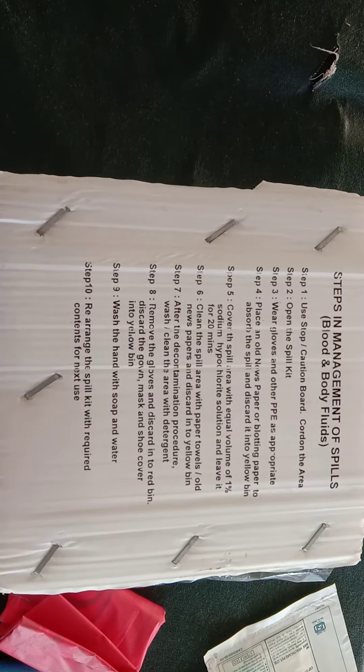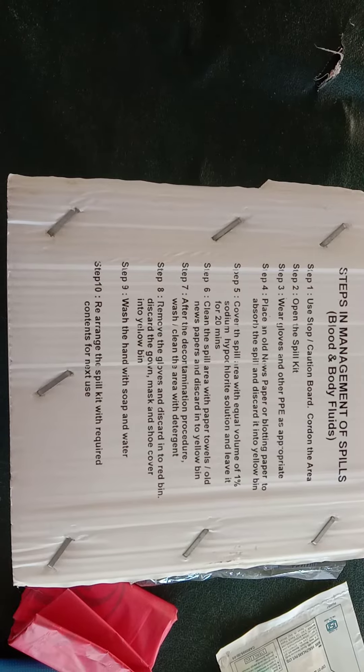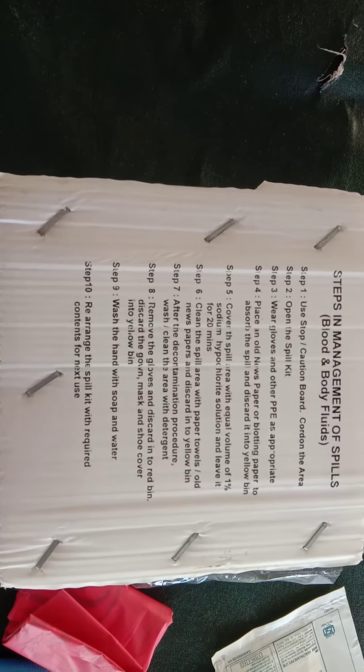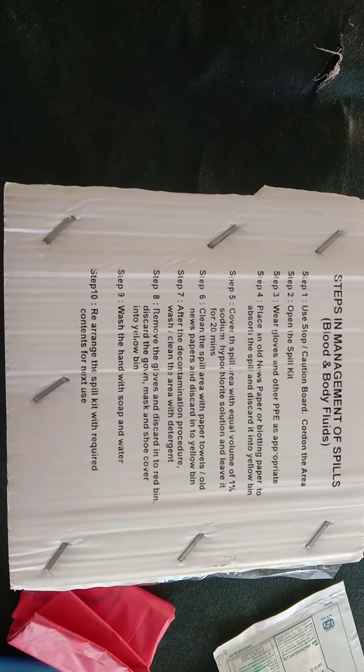Cover the spill area with an equal volume of 1% hypochlorite solution and leave it for 20 minutes. Then clean the spill area with paper towel or old newspaper and discard it in the yellow bin. After decontamination, wash and clean the area with detergent.